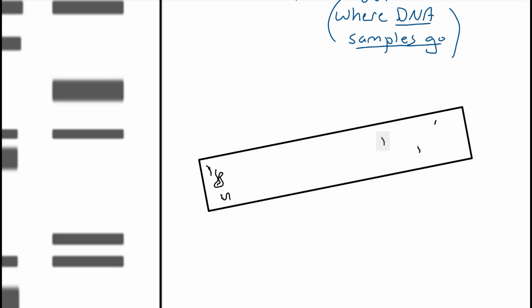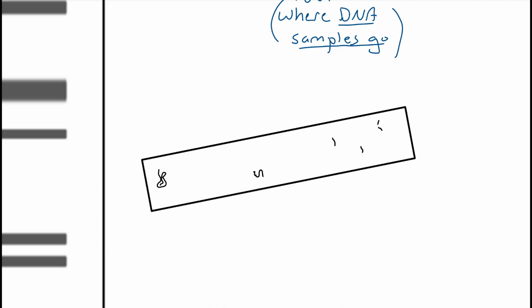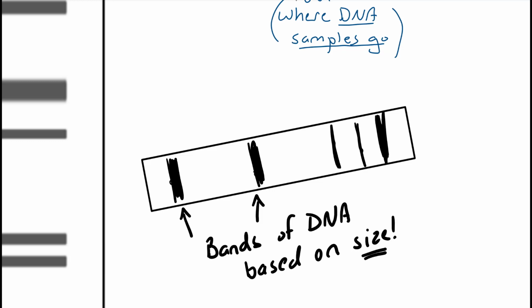And as you get bigger, the bigger the piece, the less far they travel. So small pieces travel super far. These big pieces can't travel as far. Oops. And this gigantic piece goes like nowhere. And you're going to have a lot of those pieces build up, forming distinct DNA bands, or bands of DNA. And it's going to leave a very unique pattern for each individual. So you could think of this as like your DNA fingerprint.